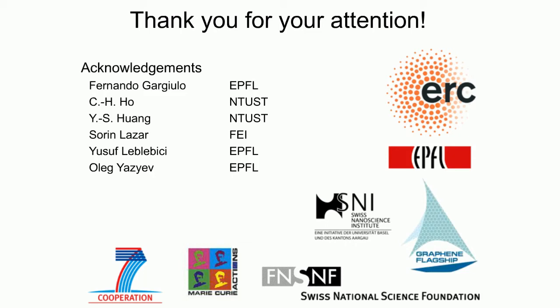And to look at this in a more subtle way, if you recall that slide where I had both the Lennard-Jones potential and then I had the force overlaid on it. When you're thinking about this conceptually, think about moving laterally along the x-axis as changing your amplitude and your set point, and moving up and down along that axis, but you have to stay on the curve now, moving up and down as changing your spring constant, right? If you make your oscillations larger, then you have a bigger line on that graph. If you make your oscillations smaller, you have basically a smaller line drawn on that graph. And so that's sort of two ways to look at that, either conceptually or practically.